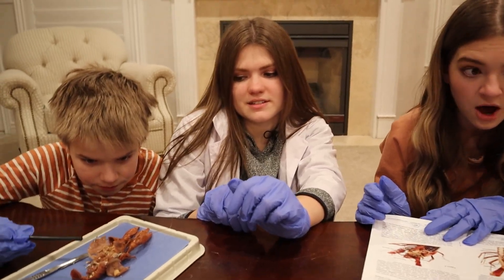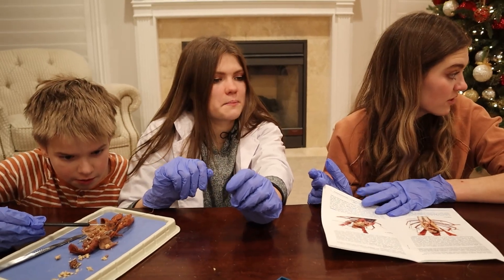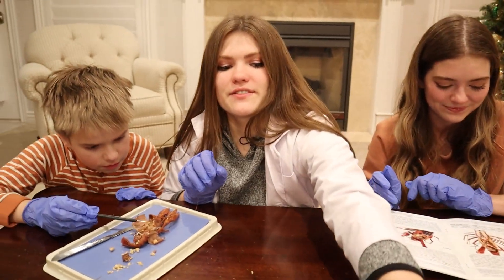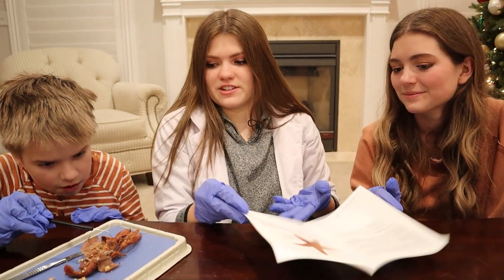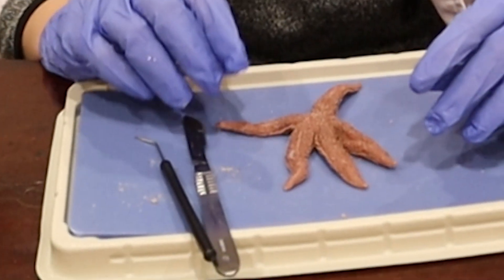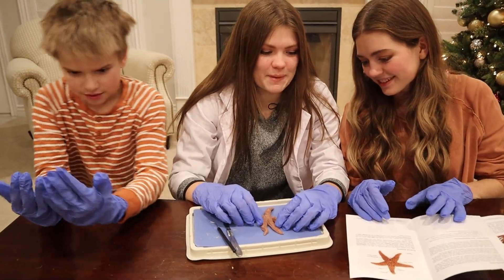What else should we dissect, guys? Do you want to do the starfish? Starfish would be kind of cool — let's try the starfish. Jake, will you do the starfish? No! All right, let's do the starfish. We have Patrick on the table. First it was Squidward, then Mr. Krabs — now Patrick.